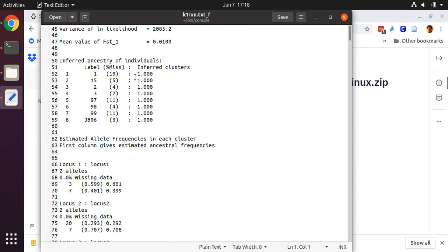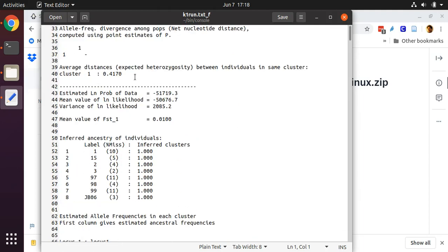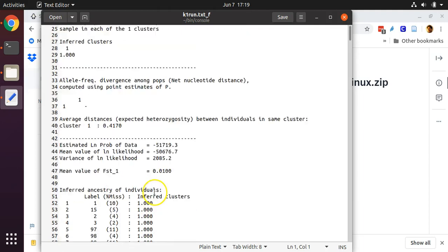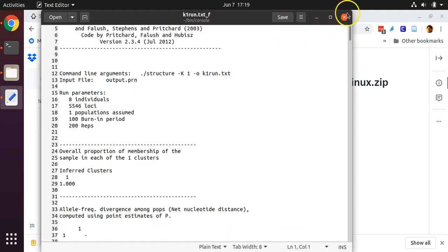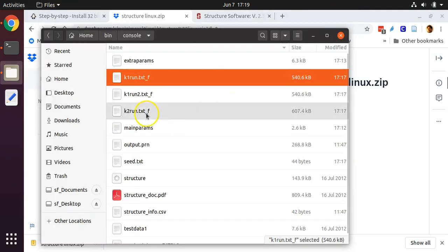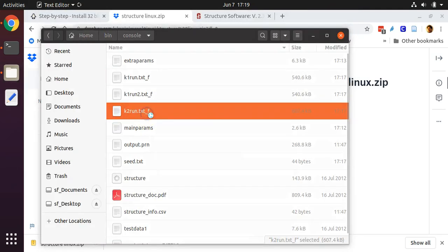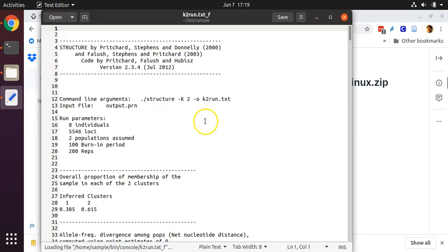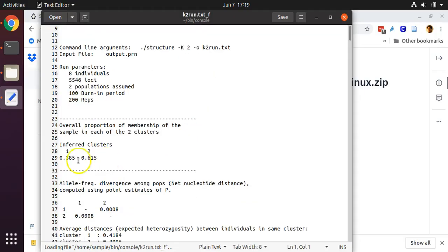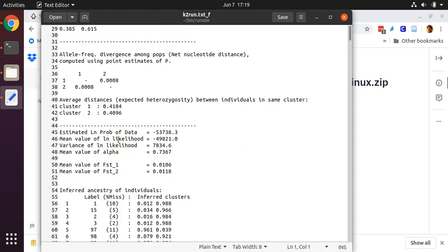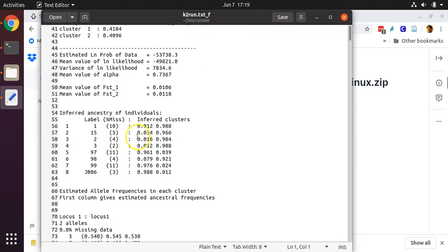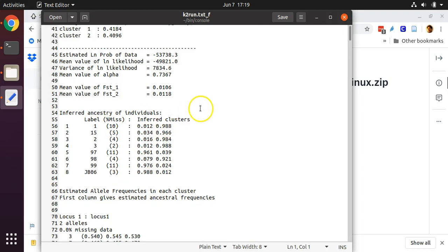But if we look at one of these results files, we'll see that STRUCTURE ran perfectly normally. You can look at another one here for two inferred ancestors, and we can see that it ran perfectly normally, and assigned our individuals among the two inferred ancestors.